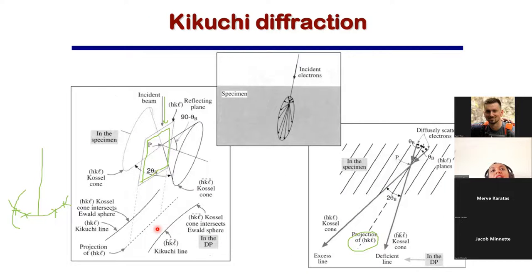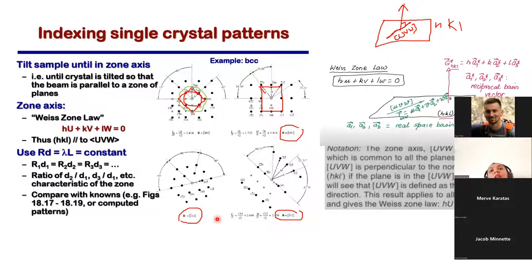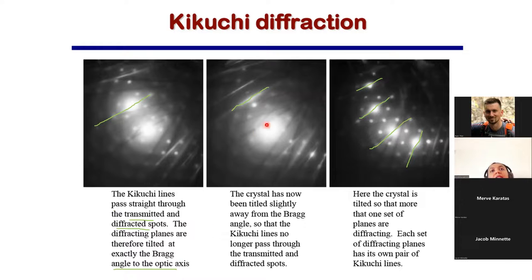Generally, you do not need this kind of diffraction pattern. Like you literally need this. This is an ideal condition. And you obtain these ideal conditions in most of the cases when the sample is good. But what we want right now is a pattern like this, because this is very important for me to characterize my sample at different Gs. I just don't do anything. I simply take my Kikuchi lines at different Gs and take the values out. Did I answer you, Ryan?